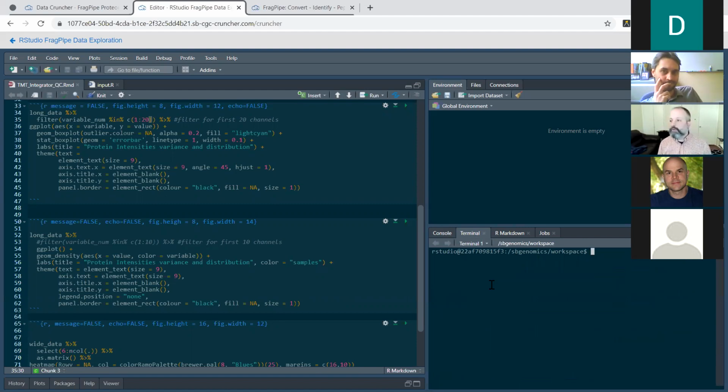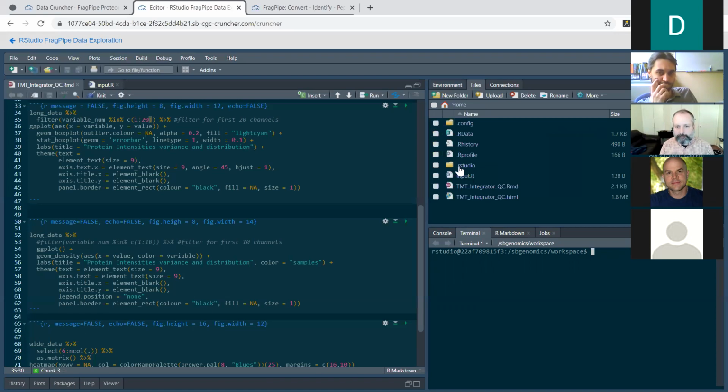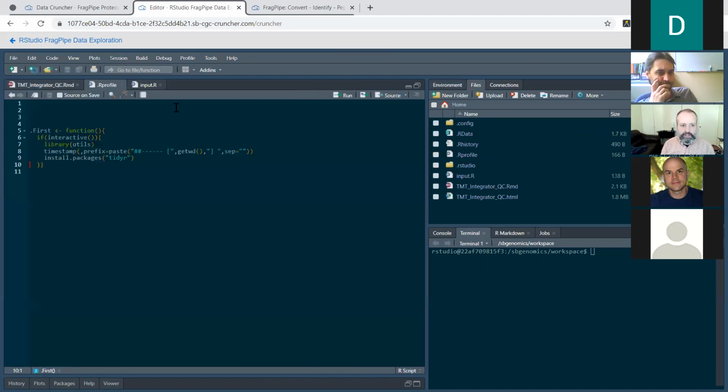So that's something that's on the roadmap to make that a better user experience. So if you do install something, when you boot up the environment, it'll be there for you. But a lot of times I'll just make, that's what I included here. I learned how to do this just for this webinar. If you're an R person, there's a .Rprofile, which you can go ahead and just type in the packages you want to install, and it'll automatically install those when you start it up.